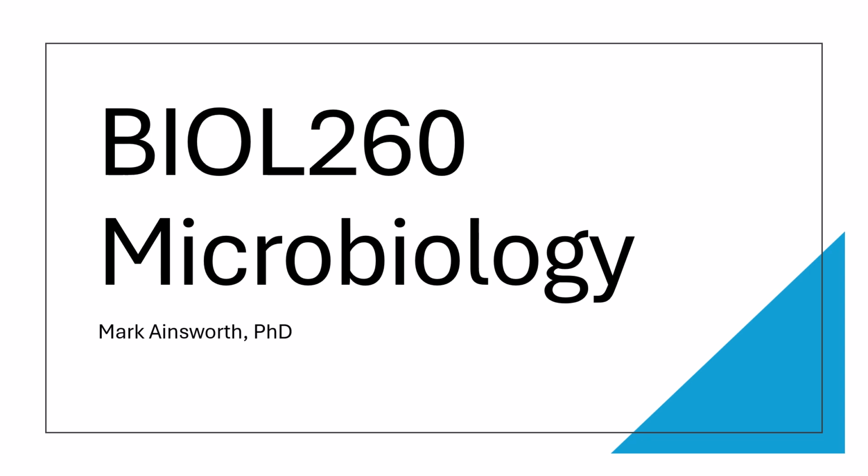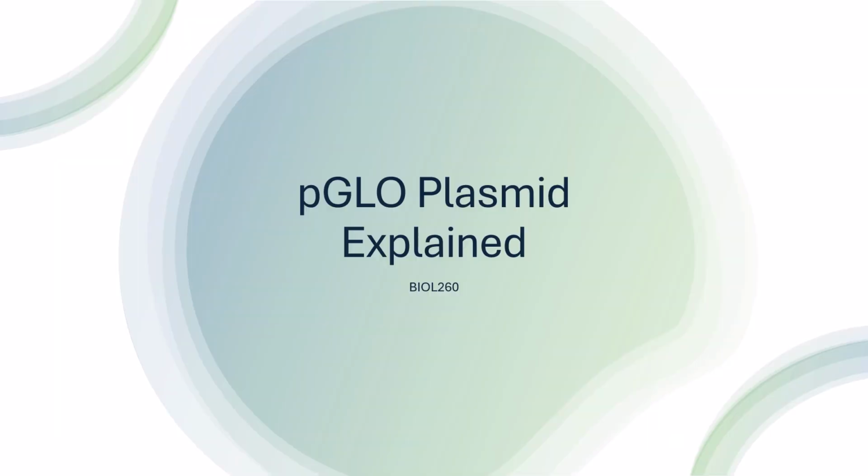Welcome to another microbiology lecture. Today's lecture is going to be talking about the pGLO plasmid that we've used in lab to transform E. coli. Let's go over the details.